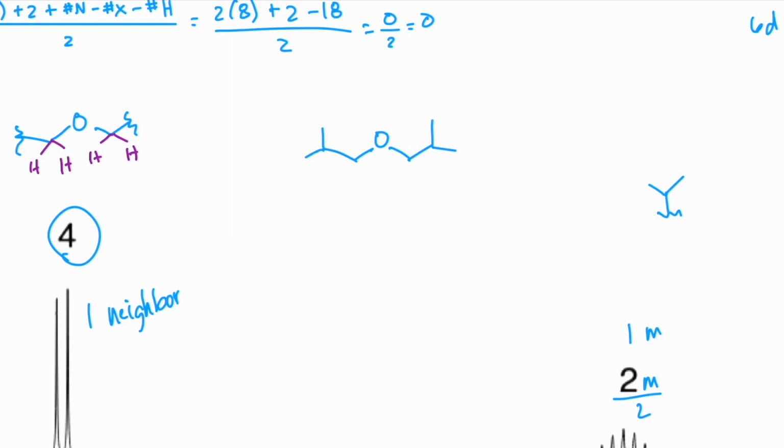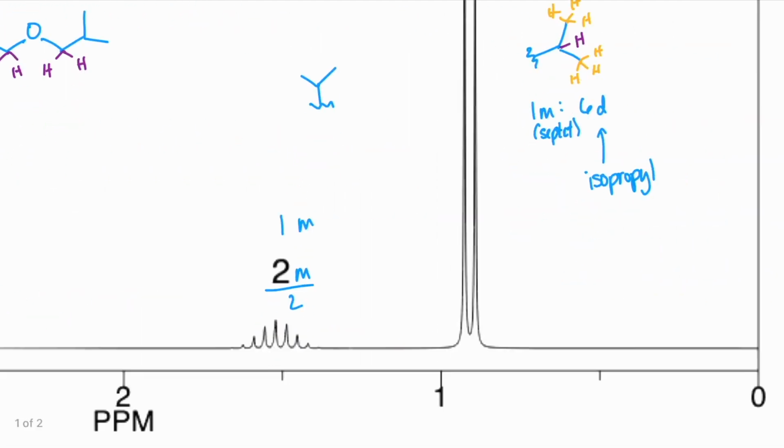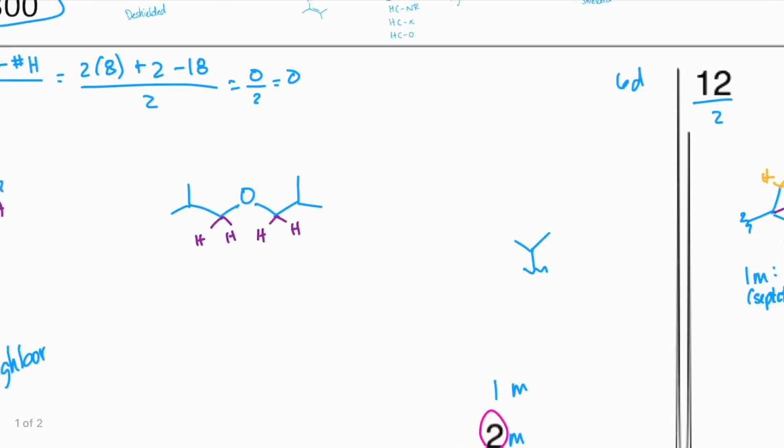is this, where I'm going to go ahead and color code the hydrogens. These 4 are here. We have 2 identical hydrogens here and here. And 12 on the ends of the isopropyls. Okay, and we should be able to go back and make sure our answer makes sense.